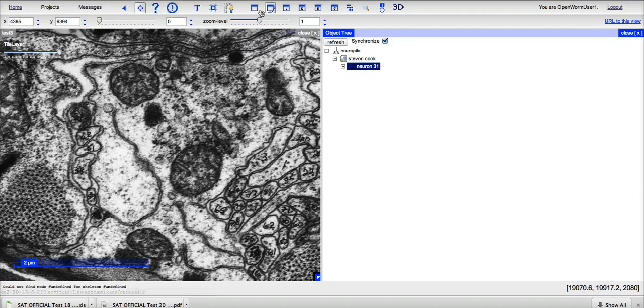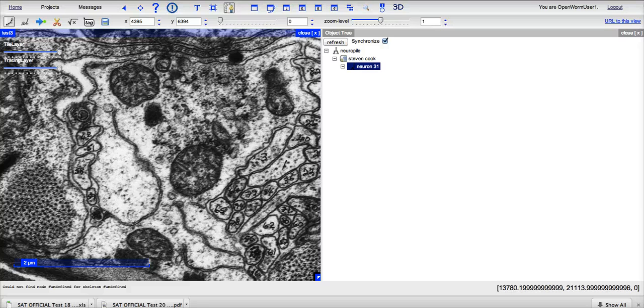So with this highlighted, you can then go to the left and click here on the tracing tool. Once you click the tracing tool, you'll see that your cursor will turn into a crosshair, and you'll be able to drop a centroid in the middle of the neuron, and that will identify the skeleton backbone for it. So making sure that you have your neuron here highlighted, again this is for organizational purposes, you can click on the image and you'll see that your skeleton 673 will show up, and that's an identifier for this object that you dropped.